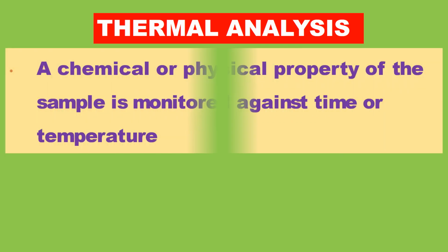What is called thermal analysis? What do you mean by thermal analysis? A physical or chemical property of the sample is measured against time or temperature. In this, a physical or chemical property of the sample is monitored or measured with respect to time or temperature.